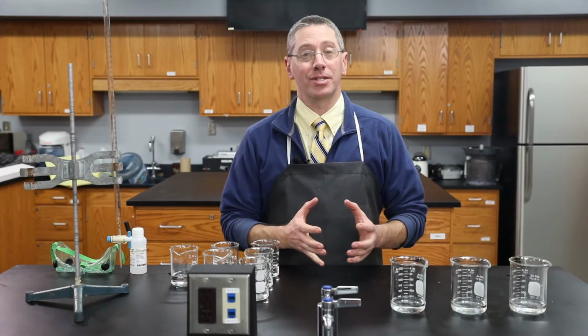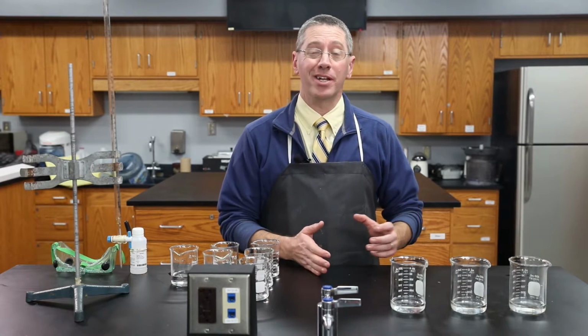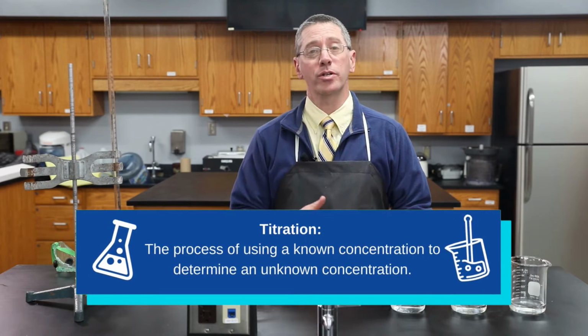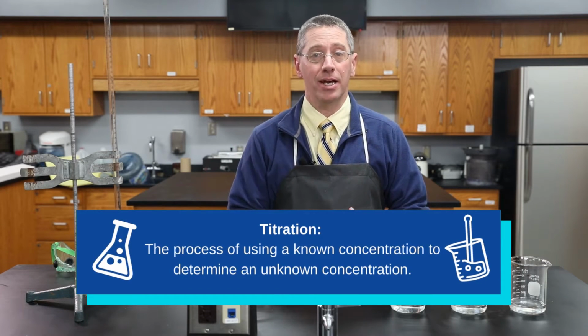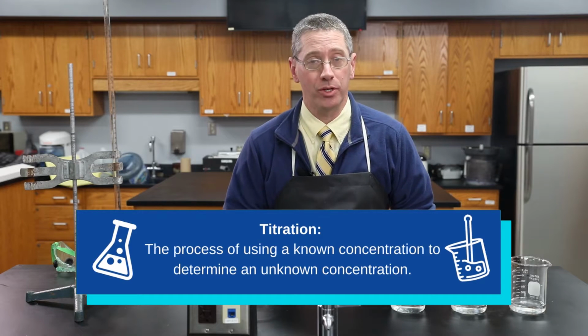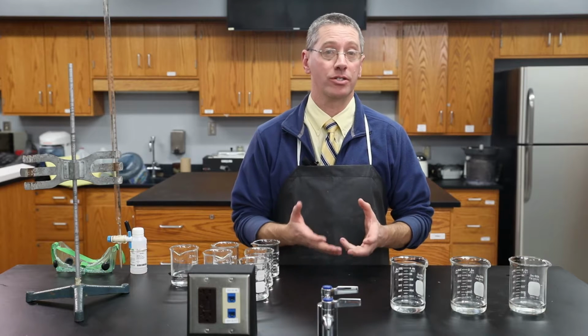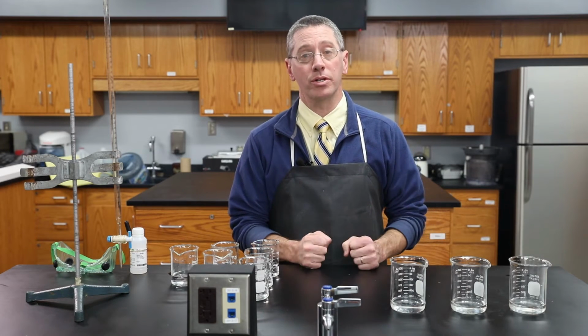In chemistry, the process of using a known concentration to determine an unknown concentration is called titration. And usually your known concentration could be a base, and you would drop it into an acid and watch for the neutralization point to appear. When it's perfectly neutralized, you can do the math to figure out the concentration of that unknown acid. And that's exactly what we're going to do right now.